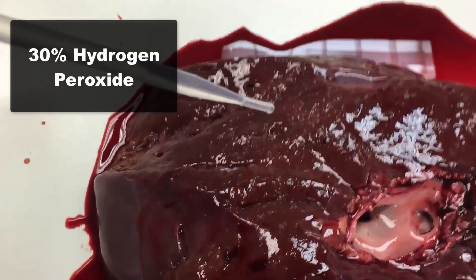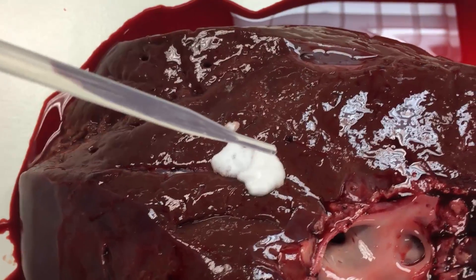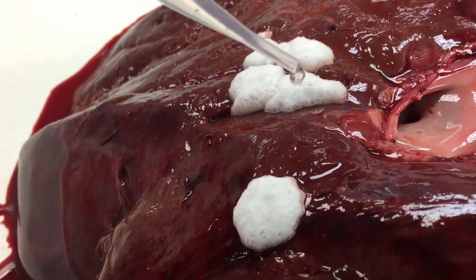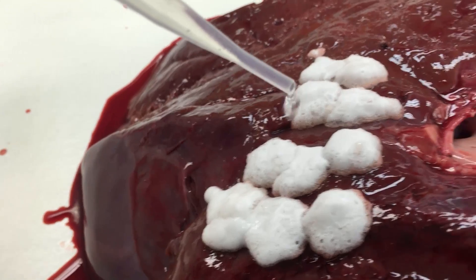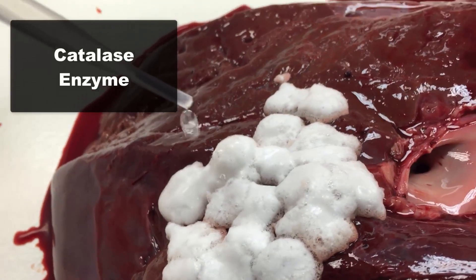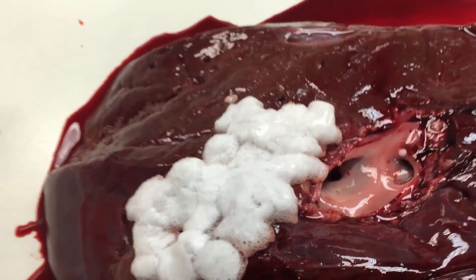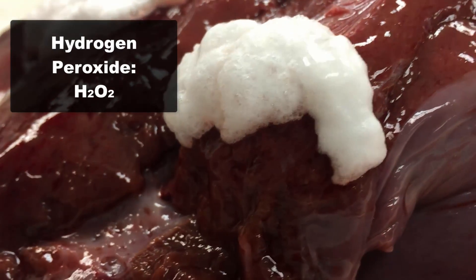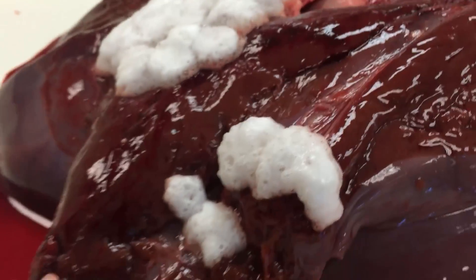What if I get out the really good stuff? In chemistry we use 30% hydrogen peroxide — the other stuff was 3%, this is 30%. And look, it just foams up instantly into a big white poof ball. It turns out the liver is full of an enzyme called catalase. It's a protein, and that enzyme actually breaks down hydrogen peroxide — that's the decomposition we're seeing, caused by this biological protein in the liver.